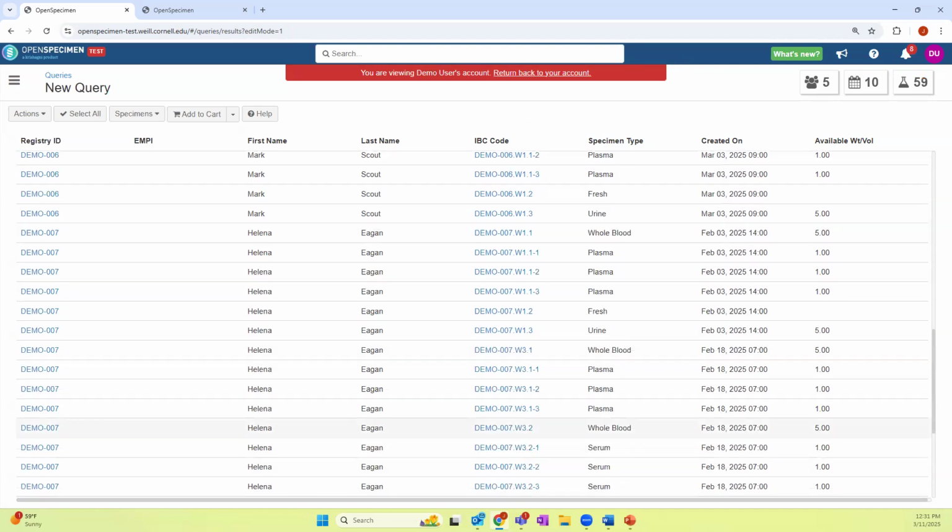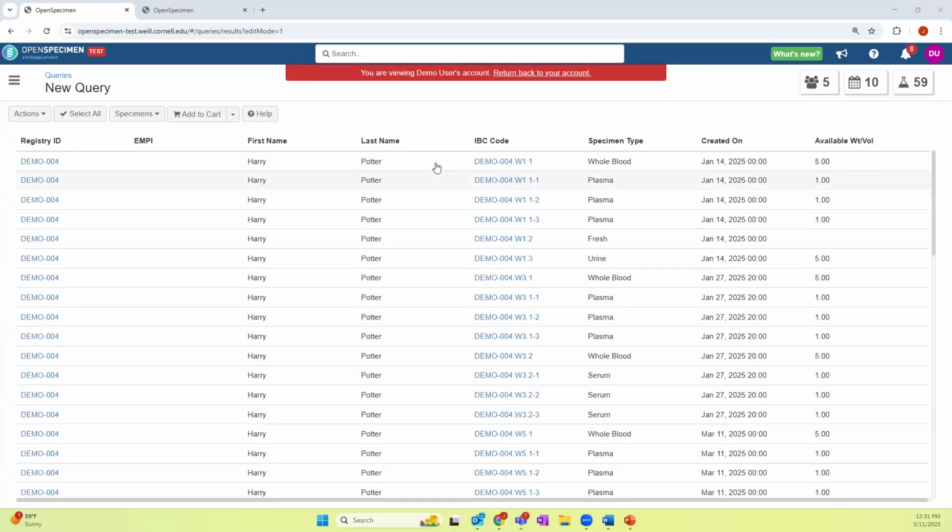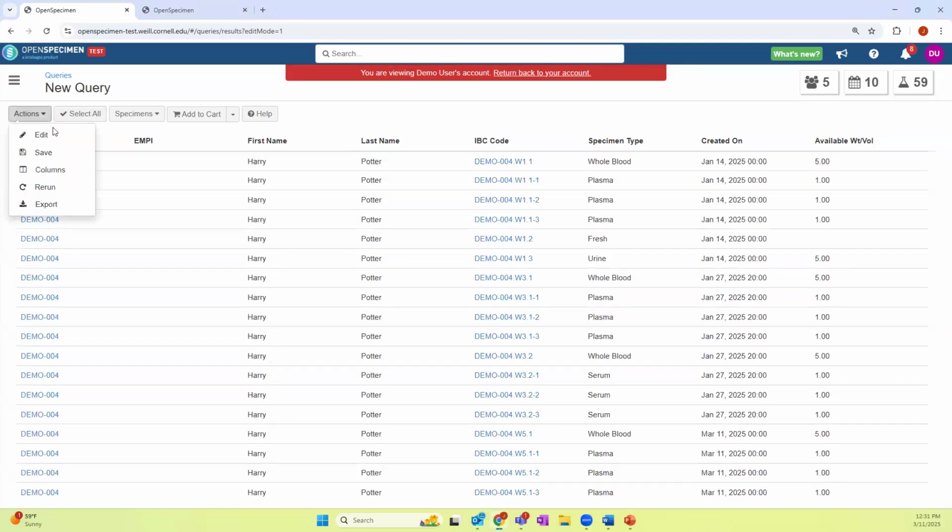This is great. Now, to go back to the question about potentially importing data into REDCap from Victoria. This is essentially where you can take this data and export it into an Excel format, and then you can import it into subsequent databases.